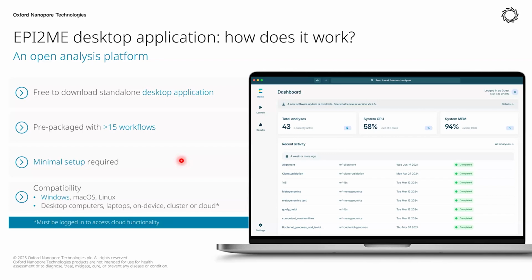Right now, we currently have, it's definitely more than 15, and we've been adding a few more recently. Different workflows that cover different applications. And again, these are all available through the graphical interface or through the command line, running it through Nextflow. And again, all of the workflows require minimal setup.